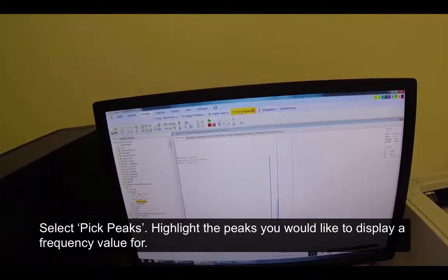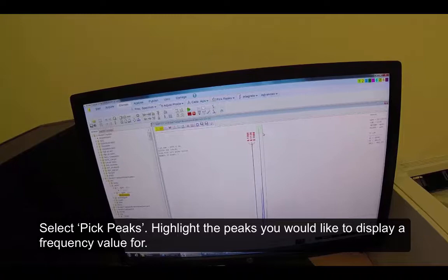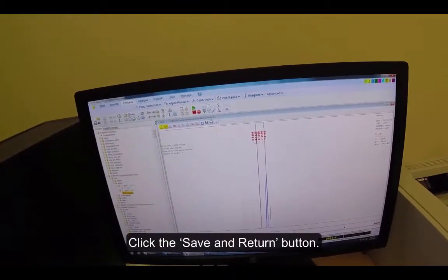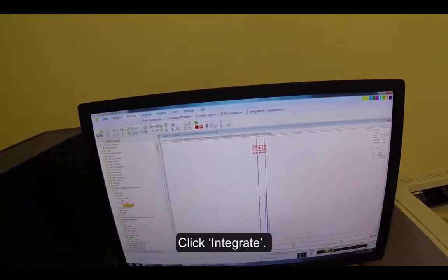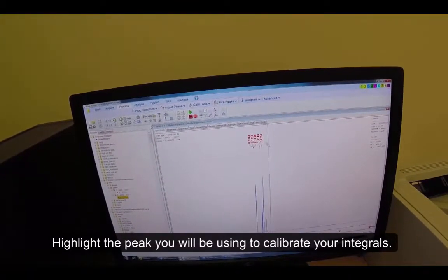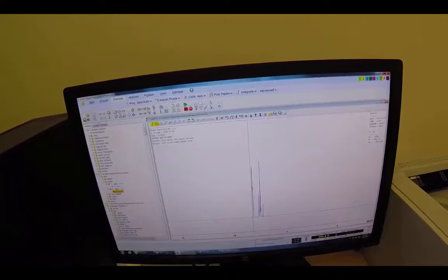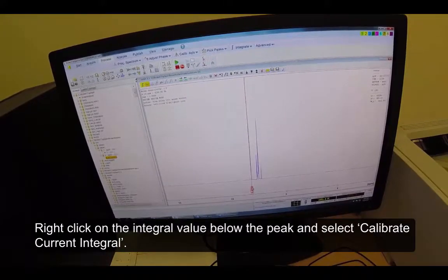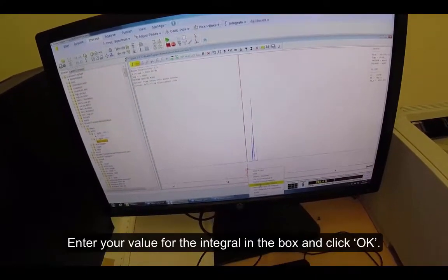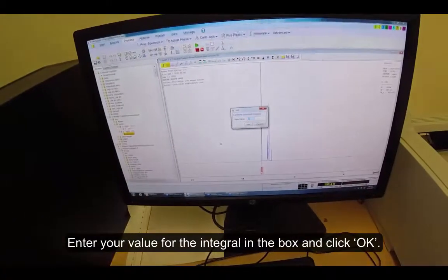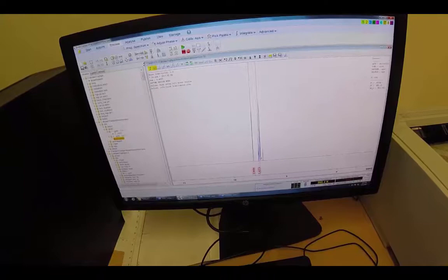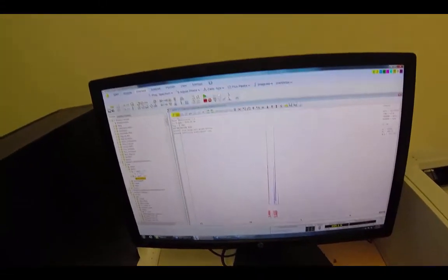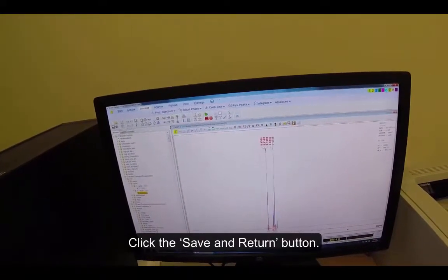Select Pick Peaks. Highlight the peaks you would like to display a frequency value for. Click the Save and Return button. Click Integrate. Highlight the peak you will be using to calibrate your integrals. Right-click on the integral value below the peak and select Calibrate Current Integral. Enter your value for the integral in the box and click OK. Highlight the rest of your peaks. Click the Save and Return button.